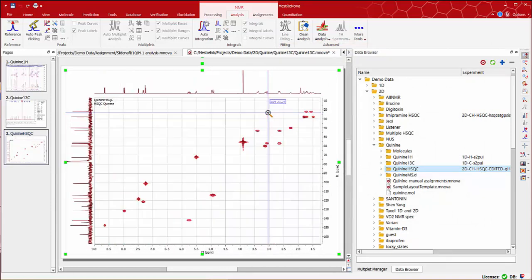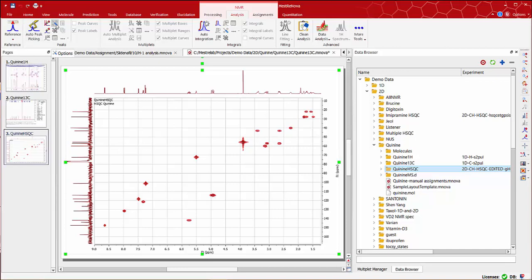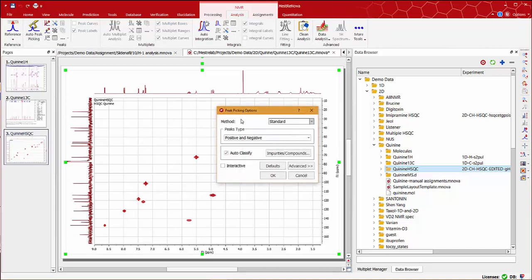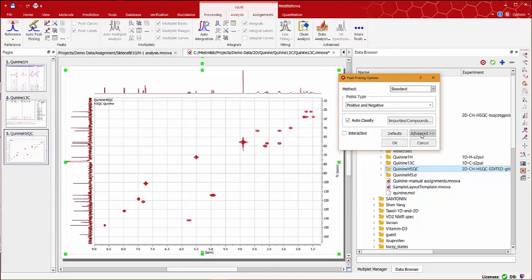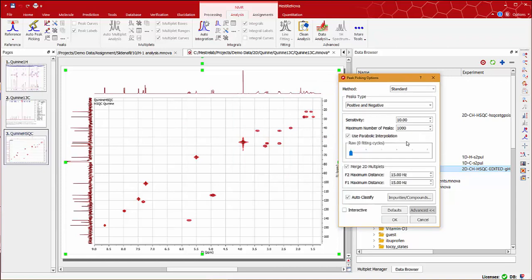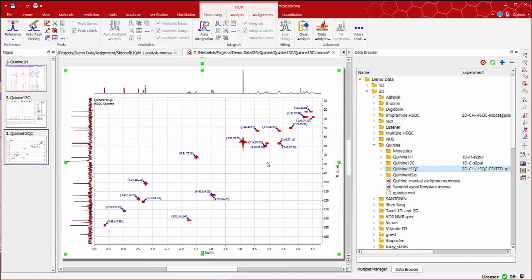Now we can do peak picking using the tools on the NMR analysis tab. If we click on peak picking's options and then select advanced, we can change any of the parameters in there. Since some of the peaks are split, we can select the merge 2D multiplets checkbox and also use the interactive mode to see the values. Everything seems fine, so we can accept the parameters.